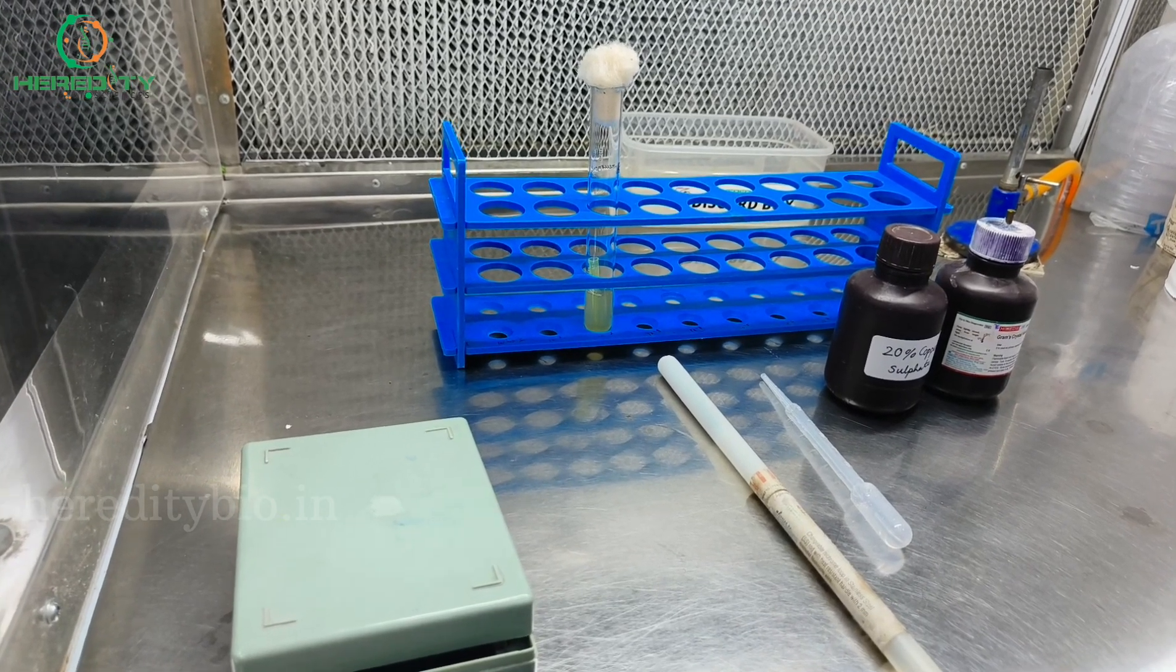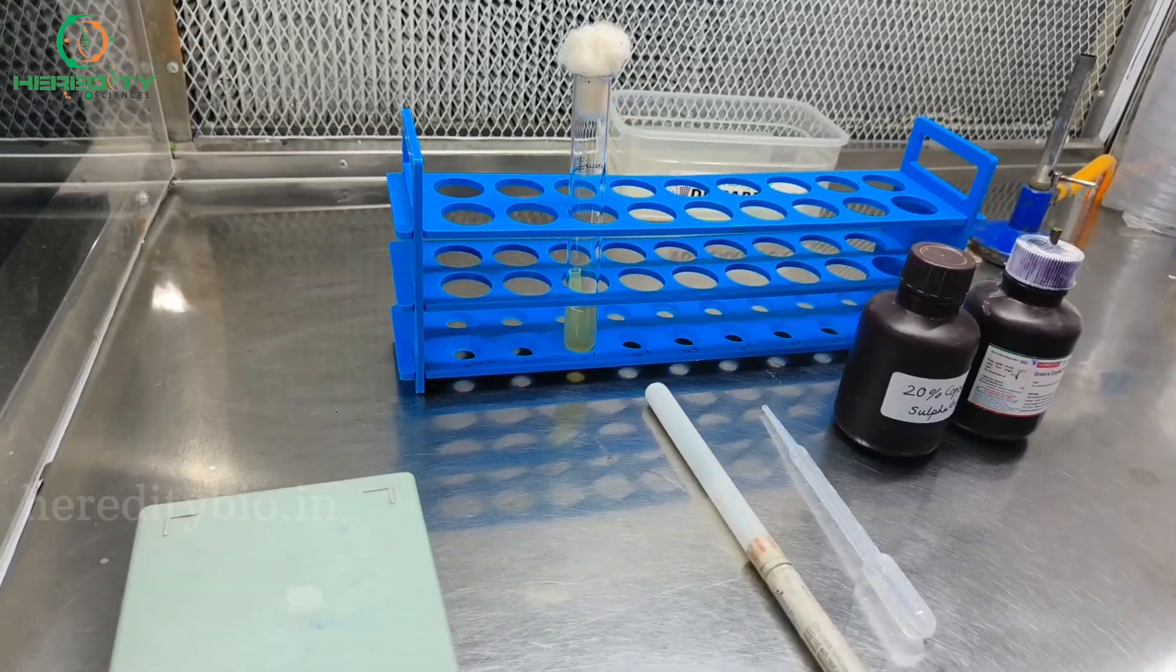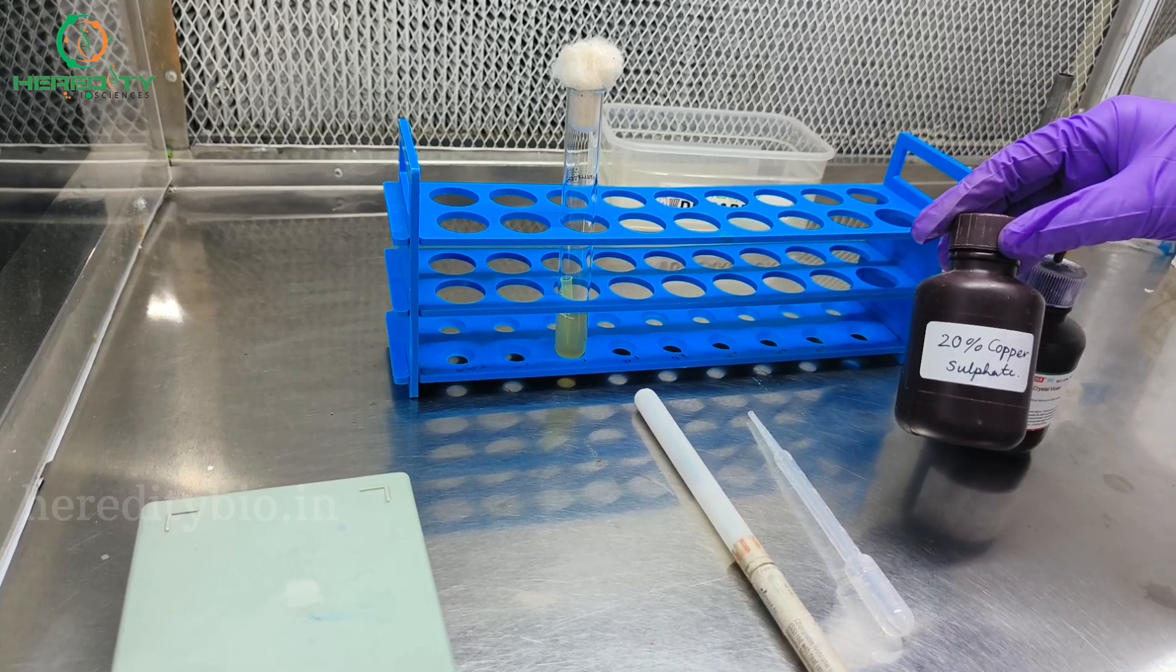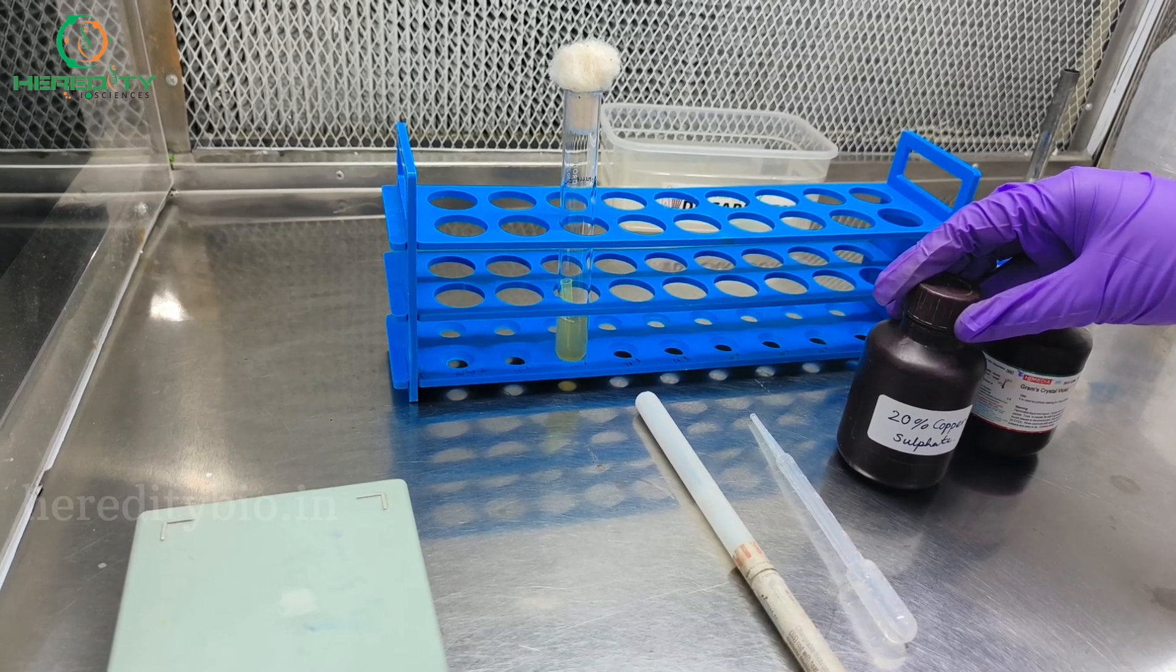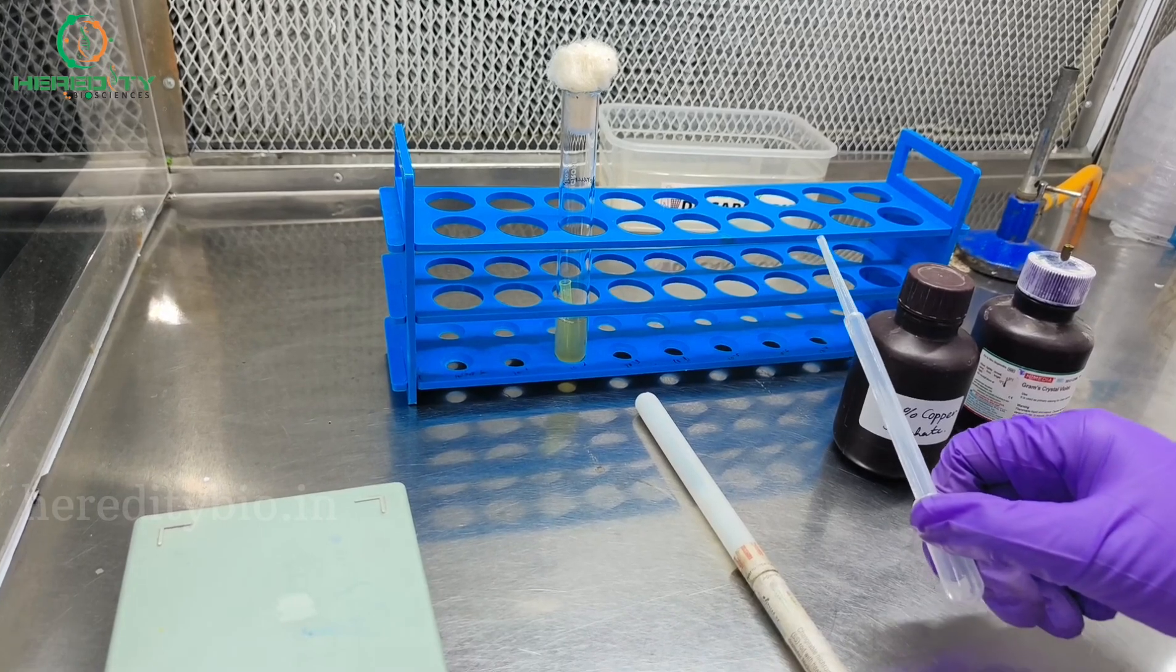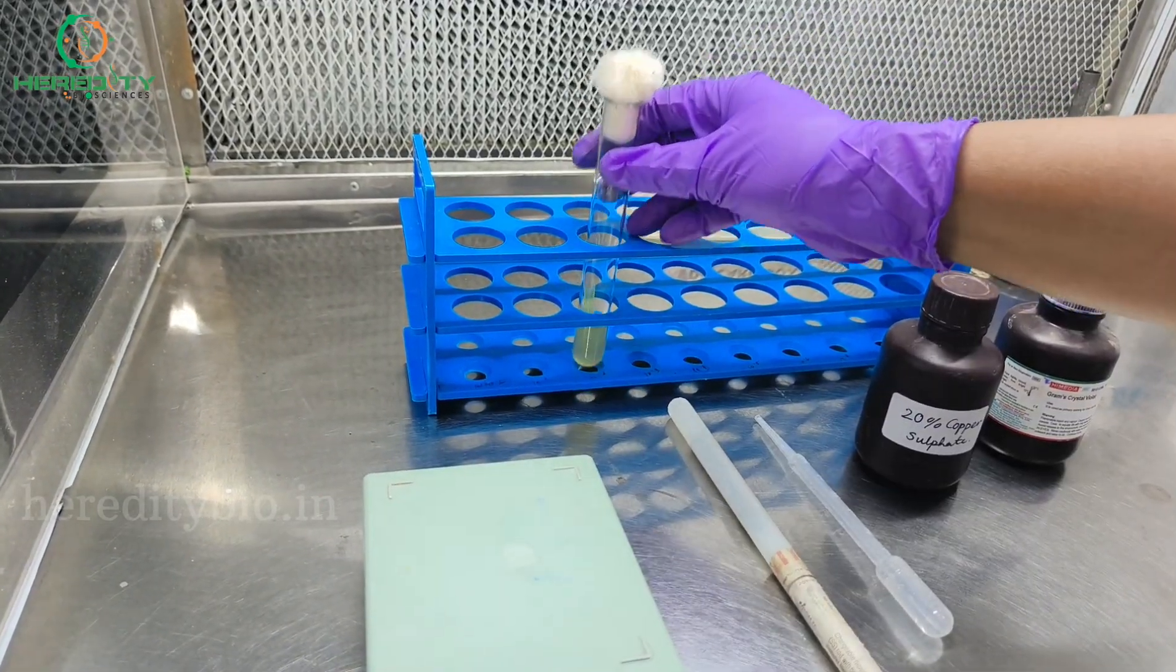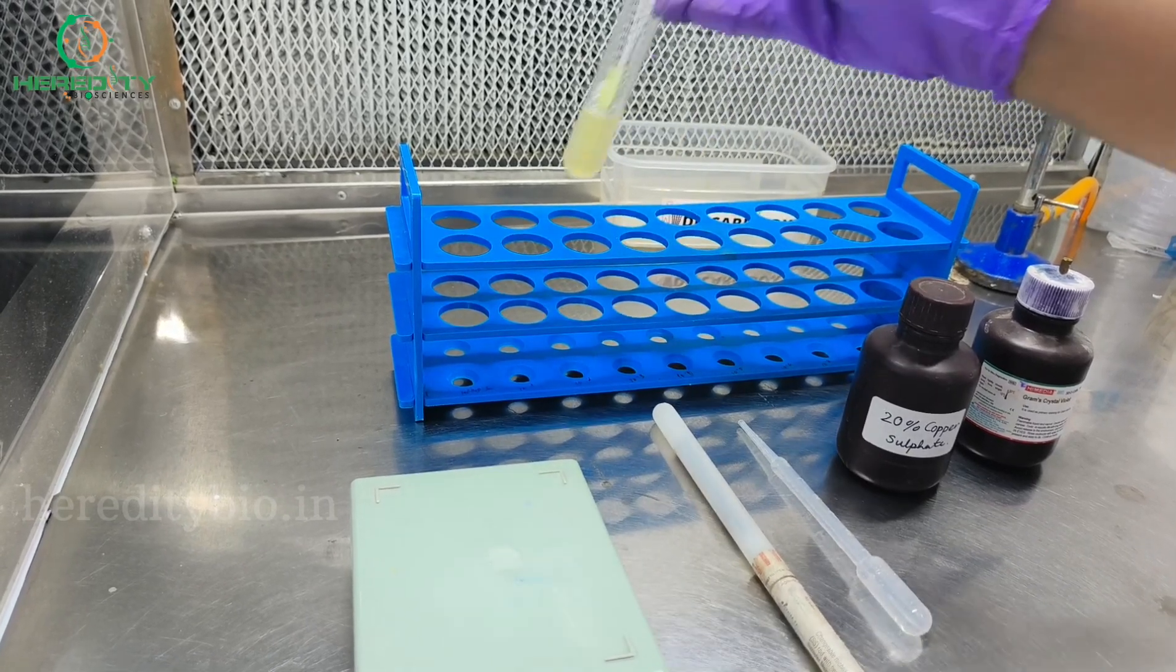Now we will go over the requirements and the procedure of Anthony's capsule staining. For performing Anthony's capsule staining, we need Gram's crystal violet as a stain, 20% copper sulfate as a decolorizing agent which we use for washing the slide. Do not wash the slide with water. We also need a dropper for decolorization, inoculation loop, glass slide, and Klebsiella pneumoniae culture because it forms capsule so that we can visualize it.